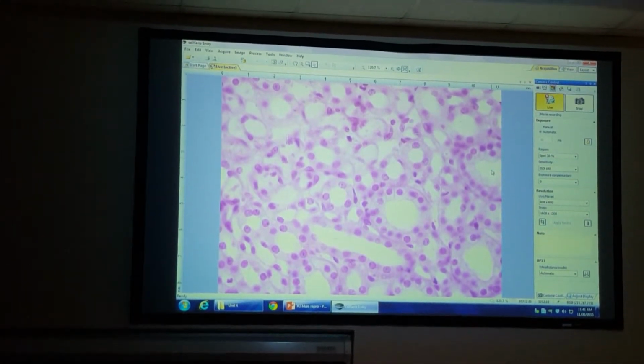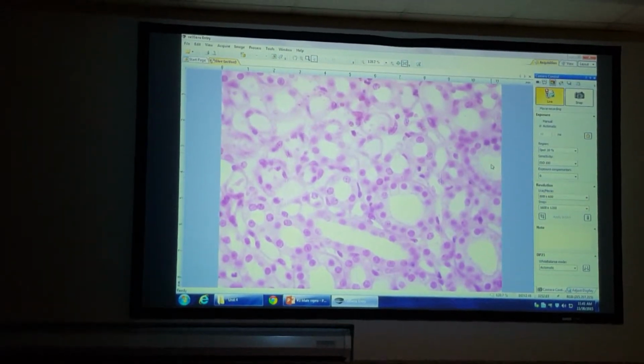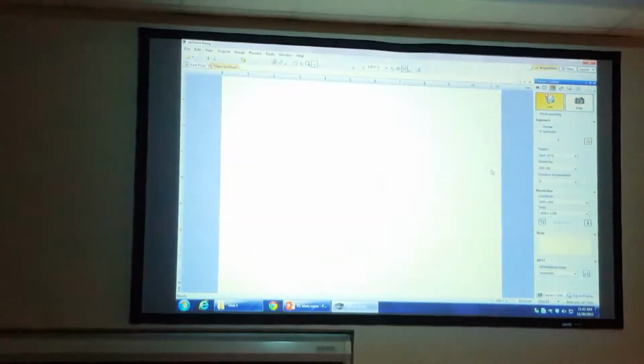So that was the renal medulla. I didn't ask you to. It's not on your list to identify because they're hard to find. Okay?